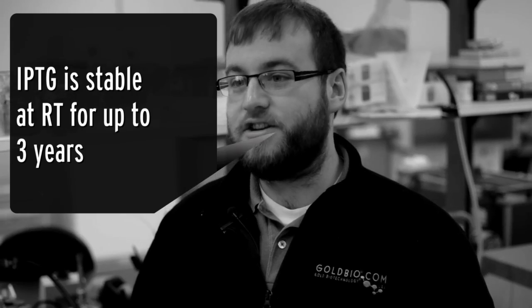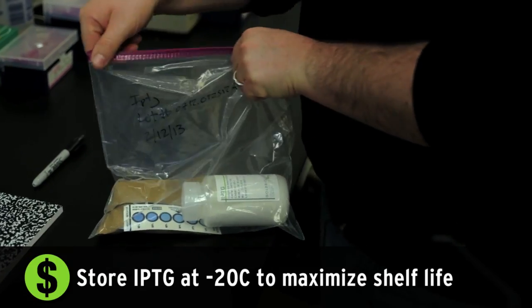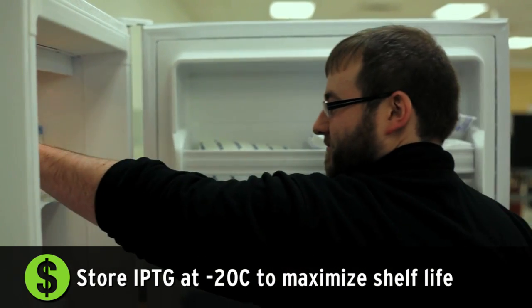For the solid powder form of IPTG, our data has shown that it is stable at room temperature for up to three years. However, we recommend that you store it desiccated at minus 20. This will give you the maximum product shelf life.